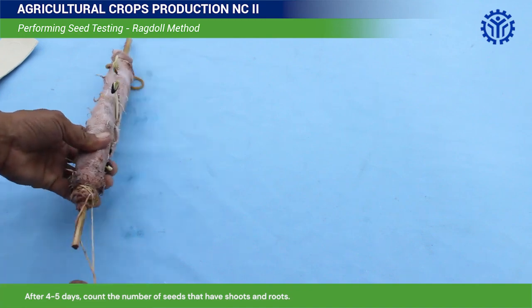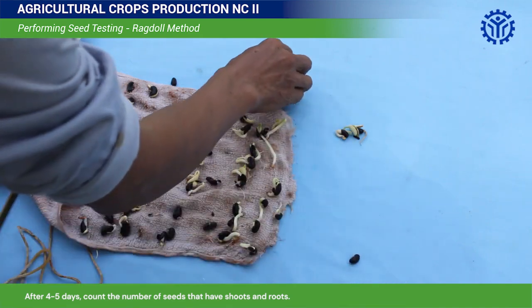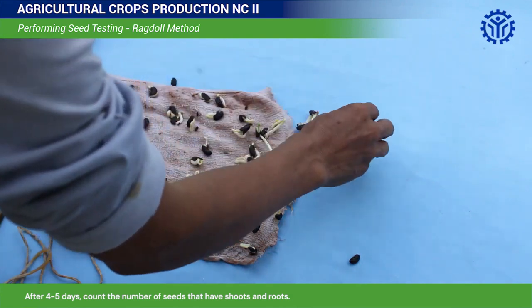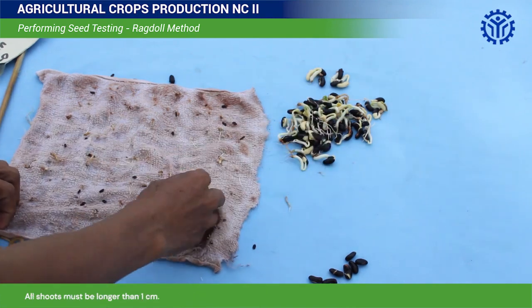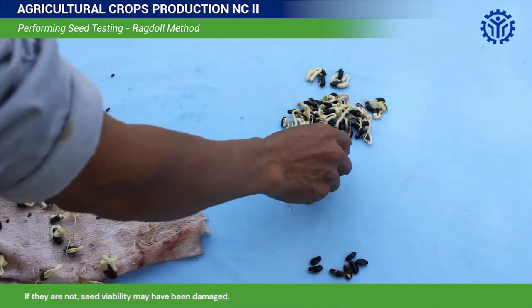After 4 to 5 days, count the number of seeds that have shoots and roots. All shoots must be longer than 1 cm. If they are not, seed viability may have been damaged.